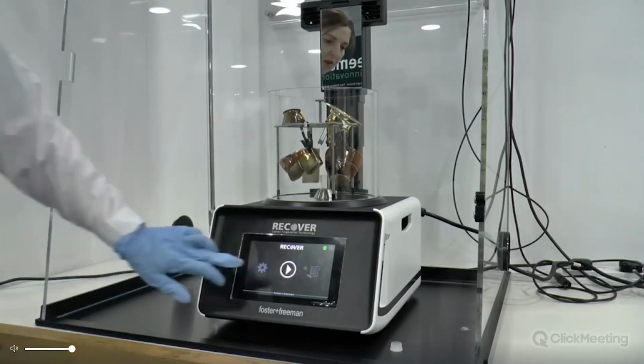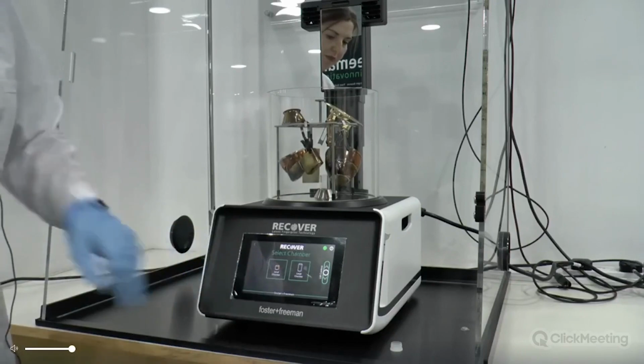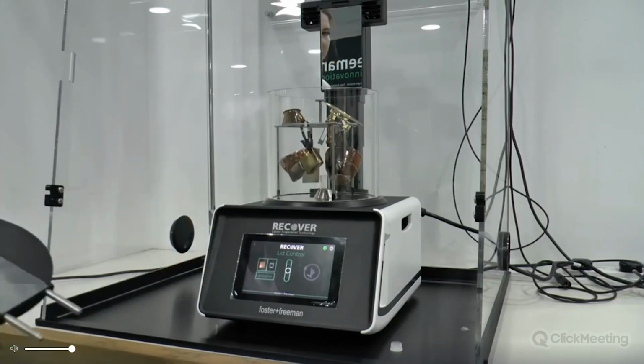Next, on the software, we will move into the software controls. You can choose whether you are going to process copper-based or silver-coloured metals, whether you're using a small or a large chamber, and then the instrument is ready.